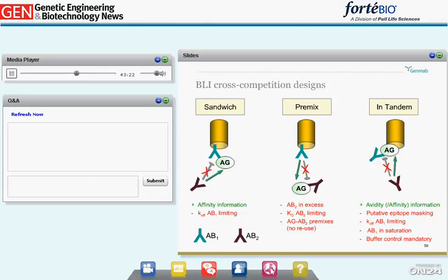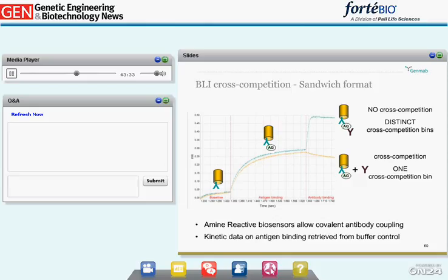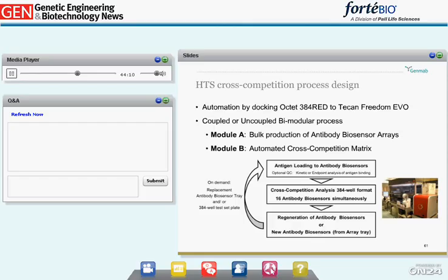We find an overview of three possible assay setups for studying antibody cross-competition with BLI technology: sandwich, premix, and tandem, already introduced in the previous presentation. In our hands, the sandwich setup resulted in the most stable and clear results and is our favorite. Here, the first antibody is immobilized to the biosensor, loaded with antigen, and additional binding of a second antibody is monitored. This is a typical sensorgram obtained in a sandwich assay setup — two biosensors are coupled with the same primary antibody, a baseline is run, antigen loaded, then dipped into two different secondary antibodies, resulting in either an additional binding signal or pure antigen dissociation indicating perfect cross-competition. We prefer amine reactive biosensors for this setup.